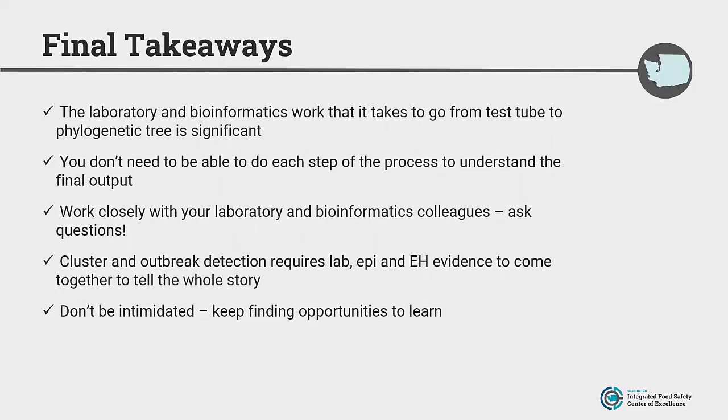Cluster and outbreak detection requires lab, epi, and EH evidence to come together to tell the whole story. As powerful as whole genome sequencing is on its own, it can never solve an outbreak without the other disciplines working in concert. And finally, don't be intimidated.